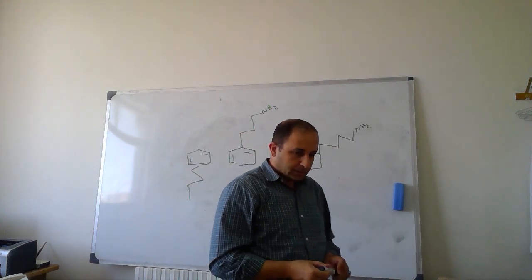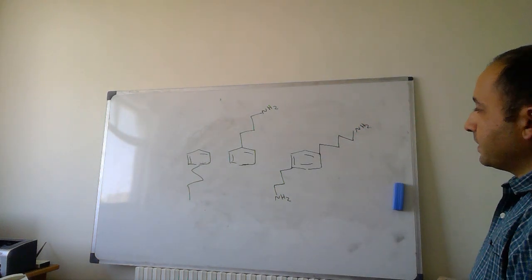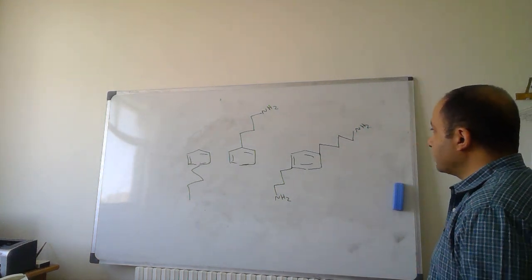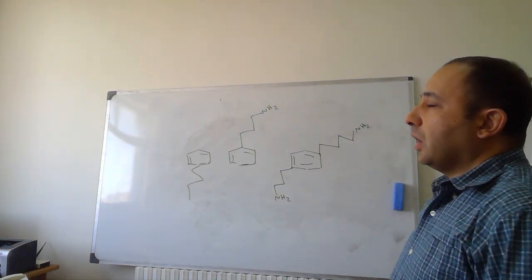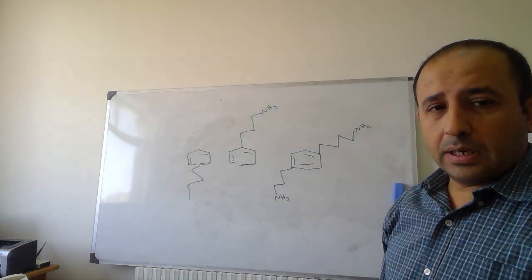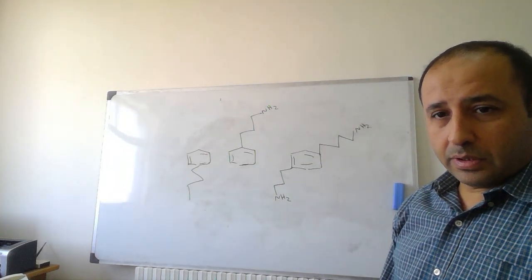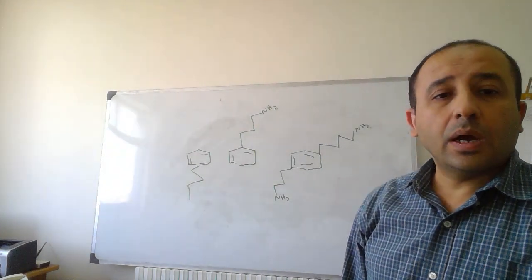Now, which kind of mechanisms can we use to get these compounds separated? Obviously, the adsorption mechanism of normal phase will be applicable.